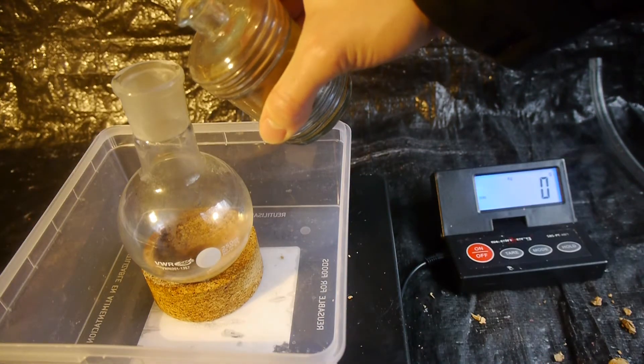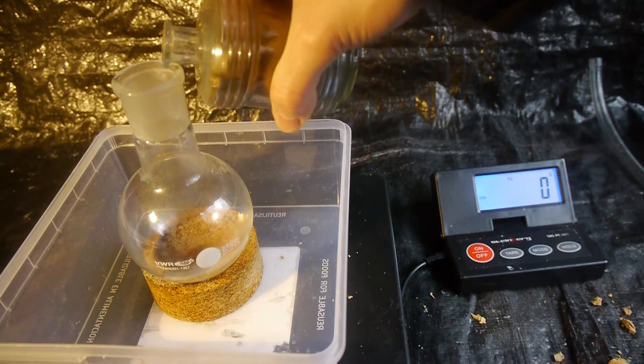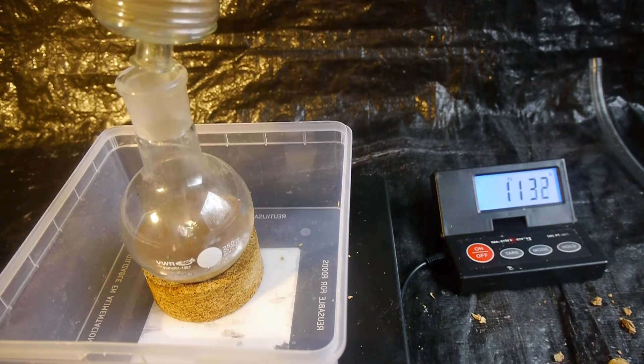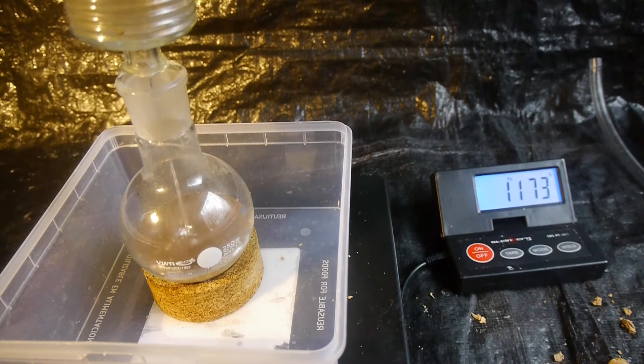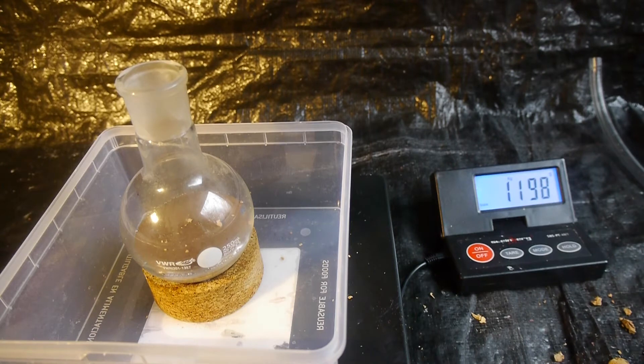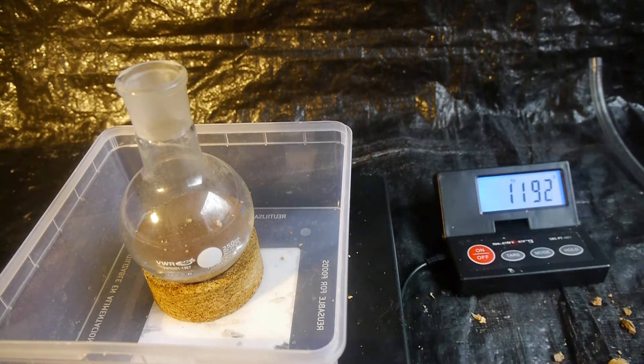And now let's pour the content into this flask. Okay, so it doesn't look like a lot but because of the high density of mercury and gold, this is more than a kilogram. Which I find quite impressive.